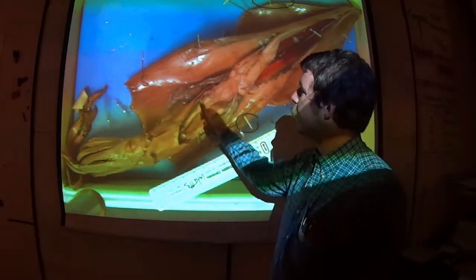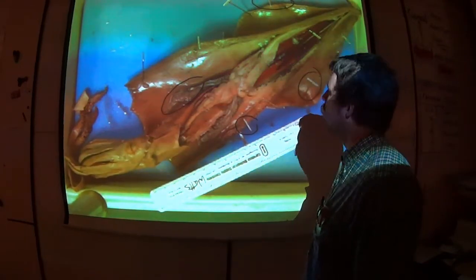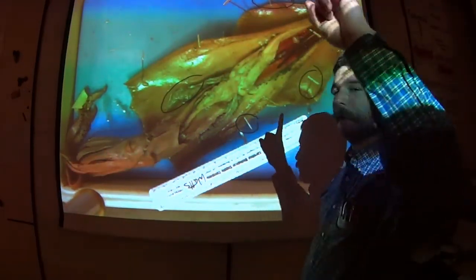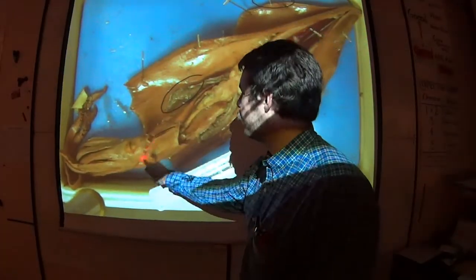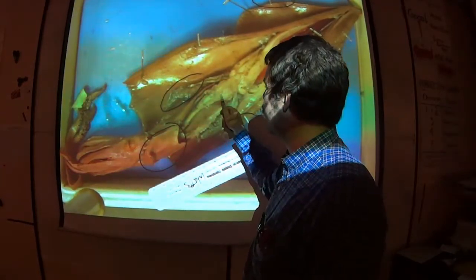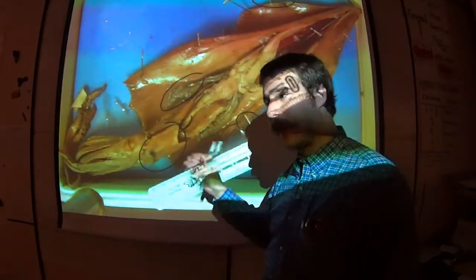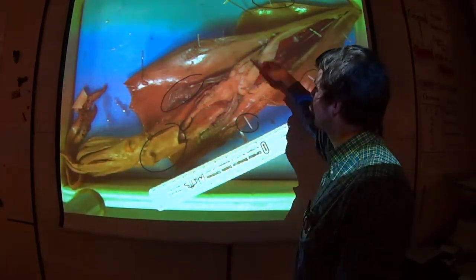But here's a picture of the squid. You should be able to see the gills on the inside there. Here's the pen underneath all that. You're going to rip that out with a pair of forceps and bonus points. Anybody that gets it out whole, you may be a surgeon later. There's the face. Here is the siphon down here. You should be able to see the intestine and the anus pointing straight into the siphon so that they can get rid of waste really nice and easily. And this push off to the side, that's the cecum.